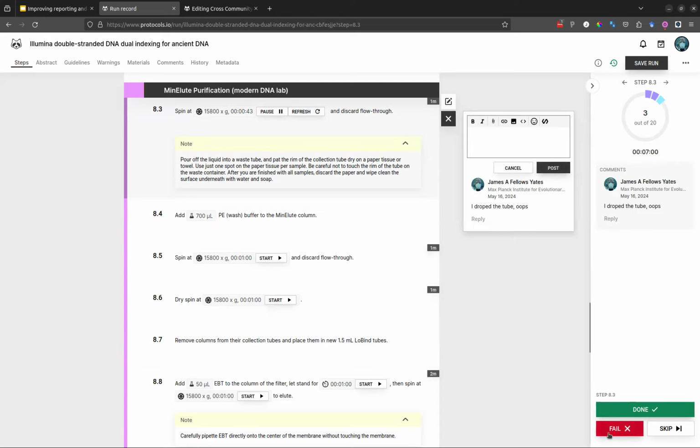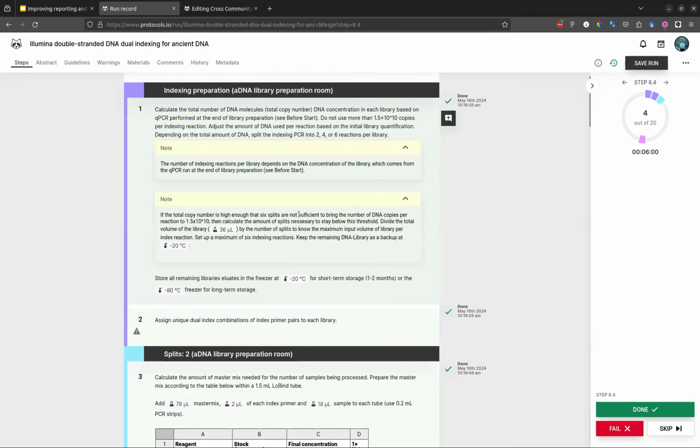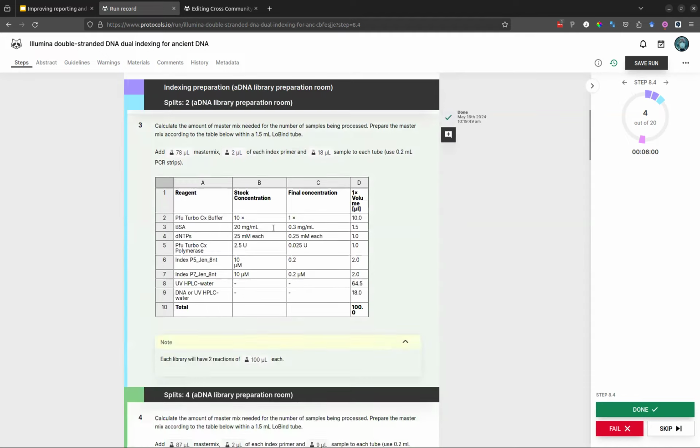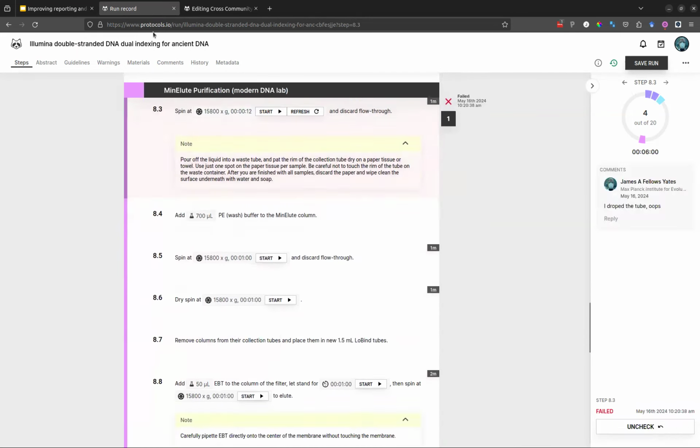So it is very interactive, and it's a way of assisting you in the lab for tracking things over time. So that's what I mean here, and you can actually go back to these. It is recorded in your profile, and I think you can also export them somewhere once you finished it. I can't find it at the moment. Probably after saving the run, to basically use it as an electronic notebook if you wish. So that's running a protocol. I'm going to stop that timer because when I practiced this, it turned on halfway through, which was quite embarrassing. It will even make a noise to tell you it's completed.